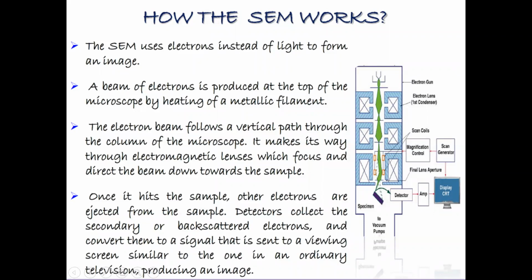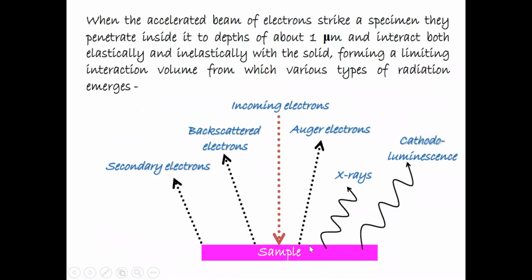Once it gives the signals and the computer recognizes them, at that time we can observe your spectra as an image, right? So this is the simple working of your SEM. तुमचं सेमचं अशा पद्धतीने वर्किंग करत.